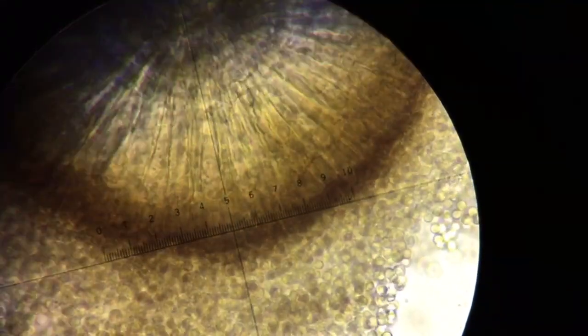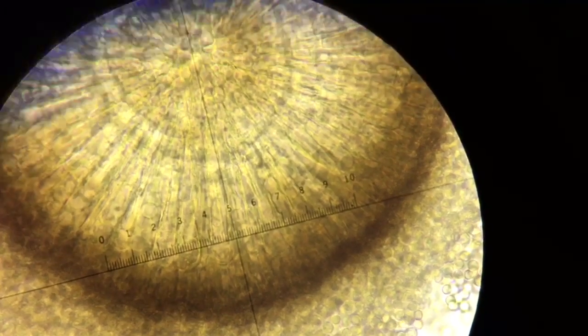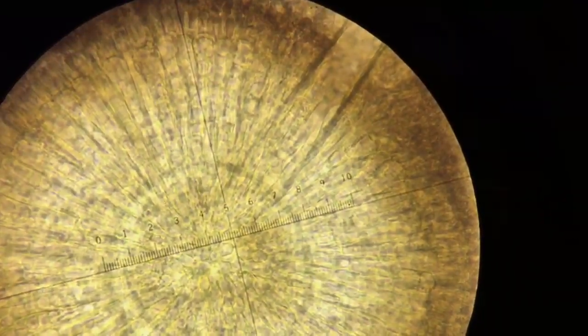Hopefully, as I zoom in and out here, we can see that we have two different cells: the metulae and then the phialides on the end, and then the spores that form chains coming off of it.